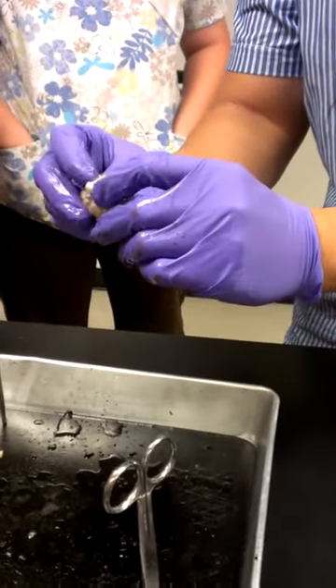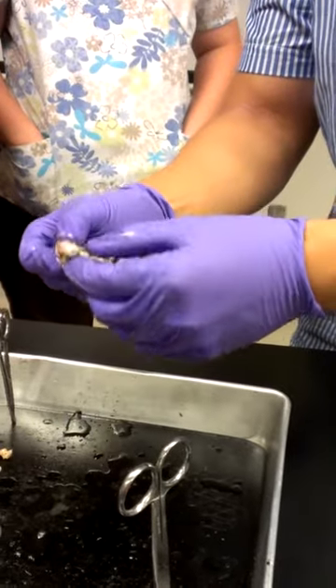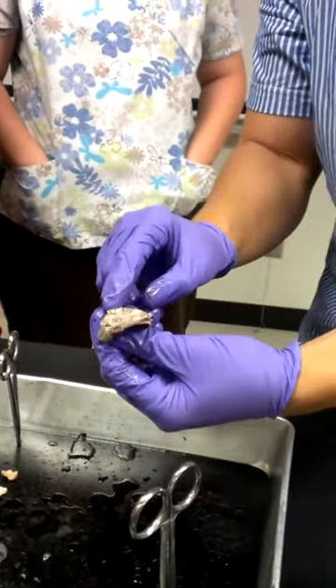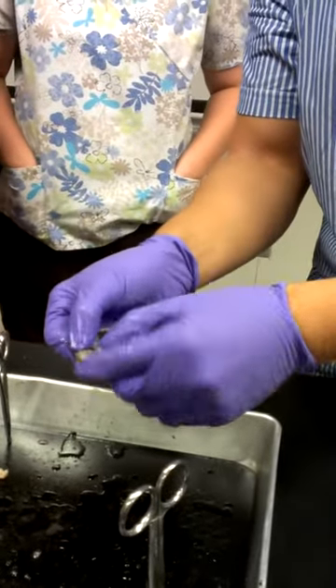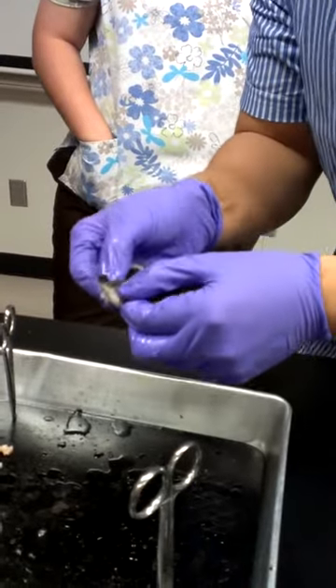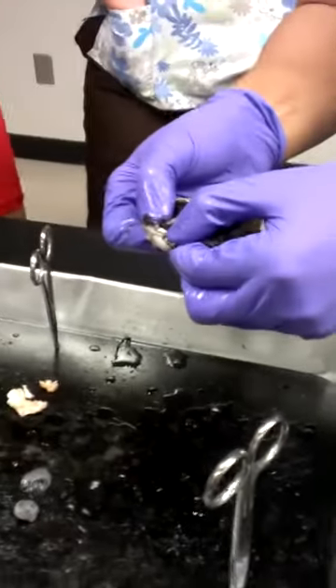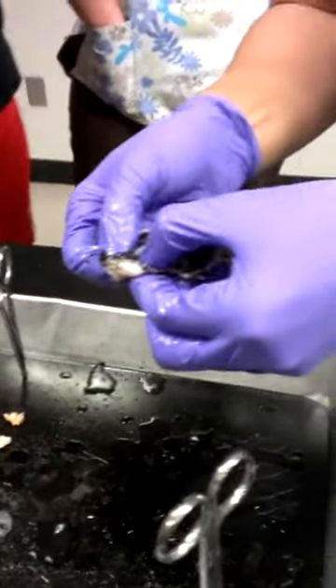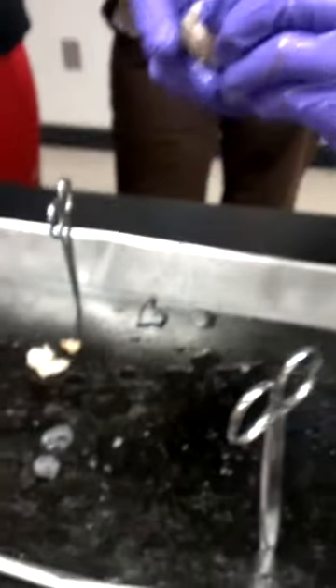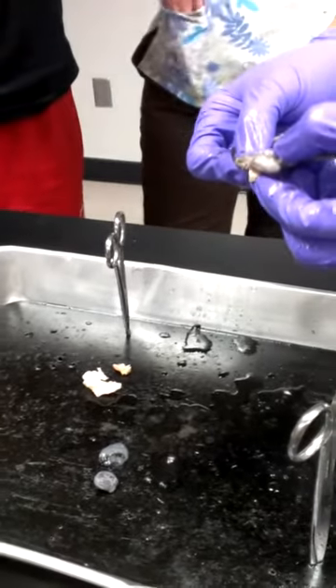When you look at the optic nerve and look at the exact opposite place inside of the eyeball where it comes in — basically where the nerve enters — that's going to be your optic disc. This little pinpoint right here. It's harder to see, but you have to look at it from where the nerve enters the eyeball.